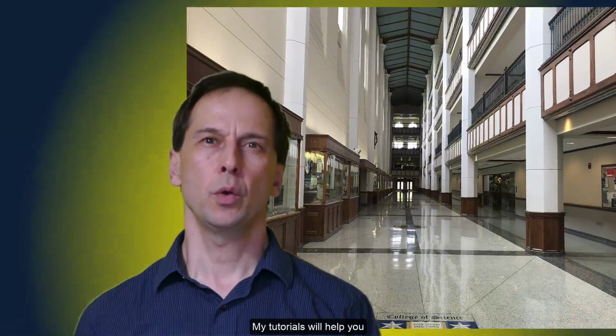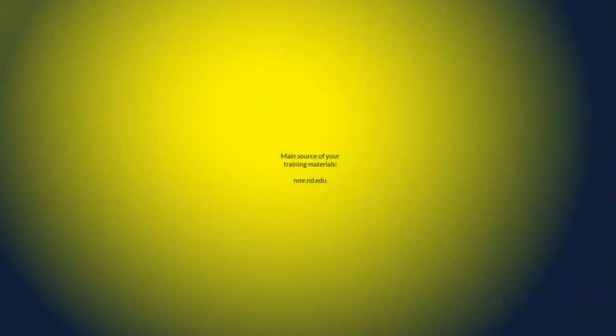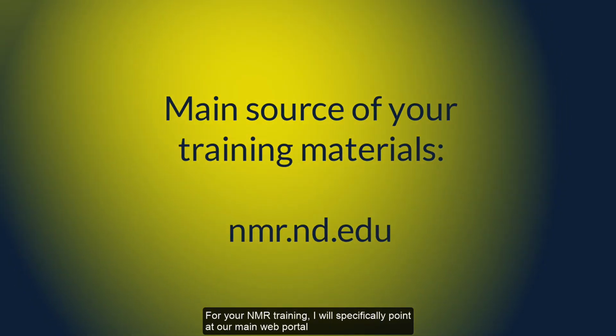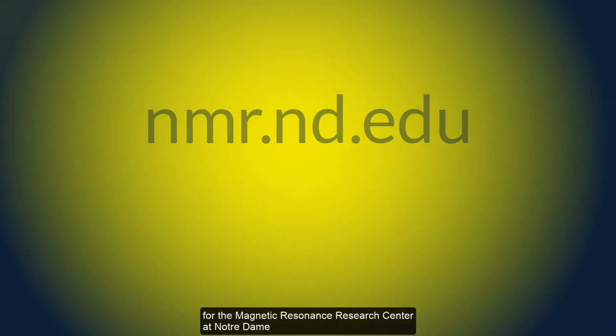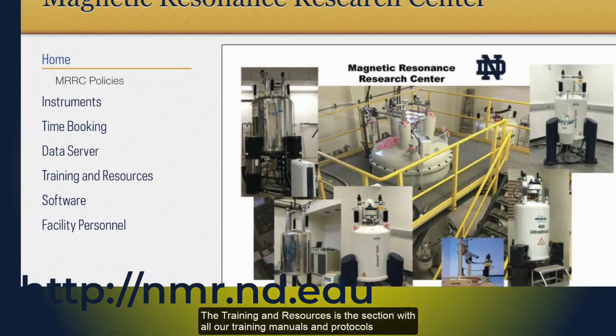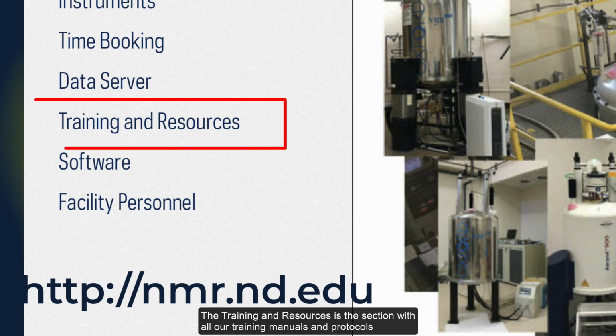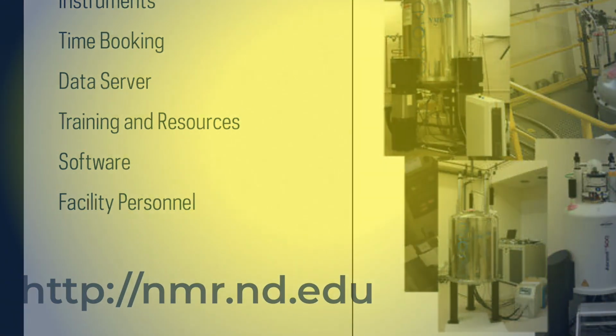My tutorials will help you master the basic skills and concepts in NMR spectroscopy that you need for your research work. For your NMR training, I will specifically point at our main web portal for Magnetic Resonance Research Center at Notre Dame. The Training and Resources is the section with all our training materials and protocols, as well as links to these video tutorials.